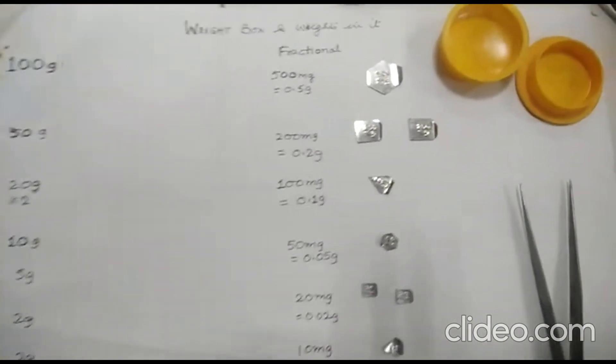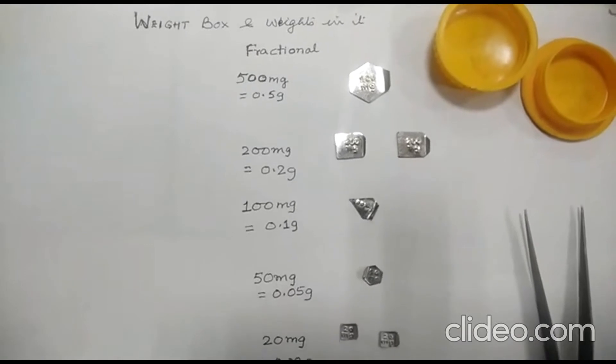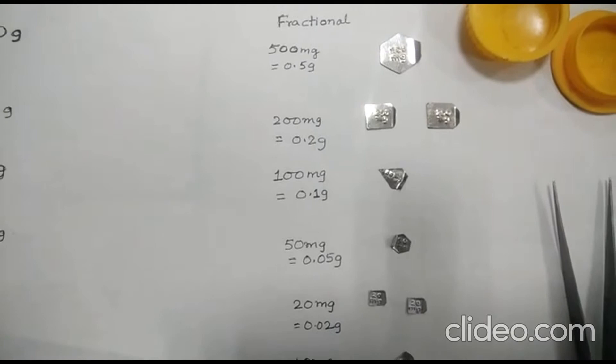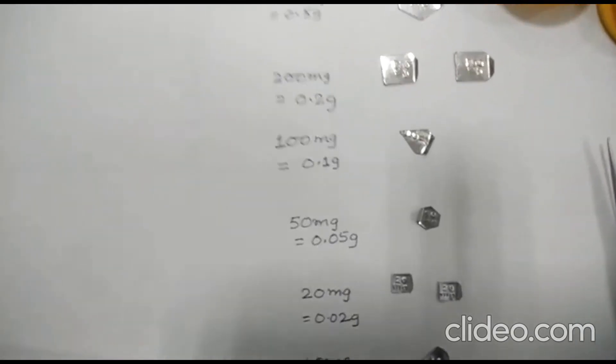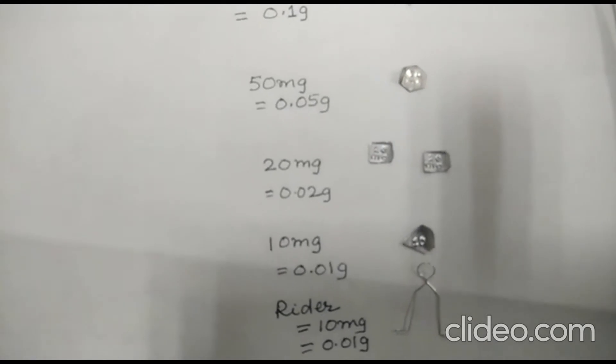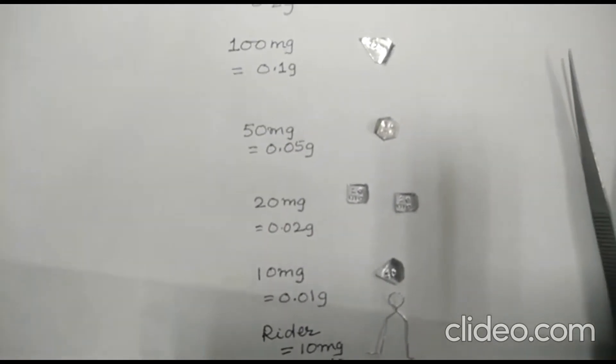Our objective is to calibrate this fractional weight box. In the fractional weight box we have the following different weights: 500 milligram — one weight; 200 milligram — two weights; 100 milligram — one weight; 50 milligram — one weight; 20 milligram — two weights; 10 milligram — one; and one rider.